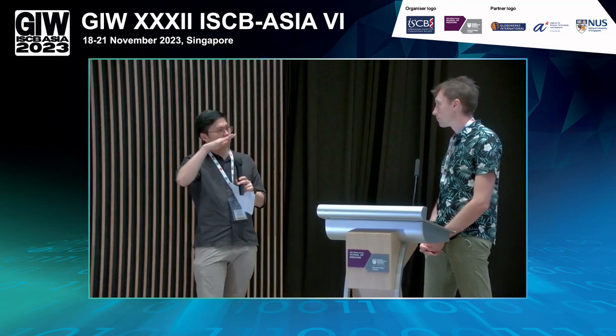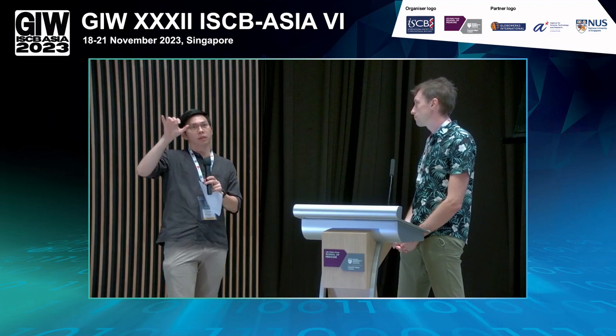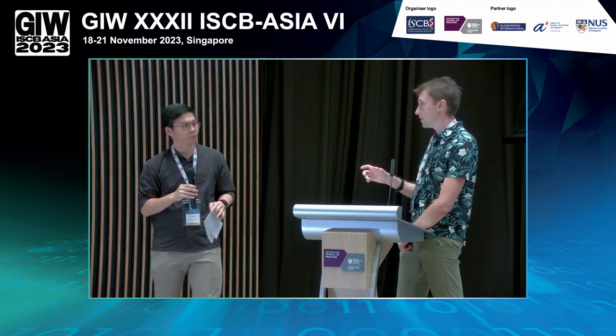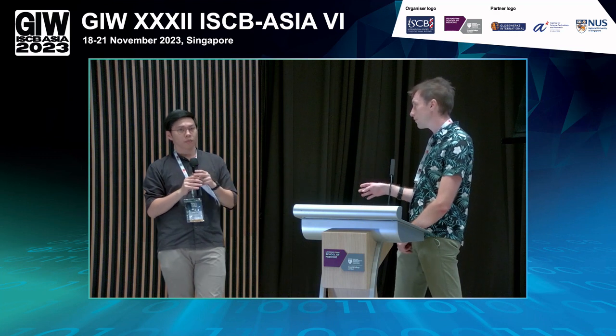So actually, I'm curious, because you showed a plot where essentially it's around 10 hours for the whole process right now, is it? So does the data analysis have to wait for the sequencing to be done, or is it done in real time, for example? So we haven't implemented it to be done in real time, but that definitely already exists for Nanopore products. So it could be accelerated perhaps by another hour by doing that.